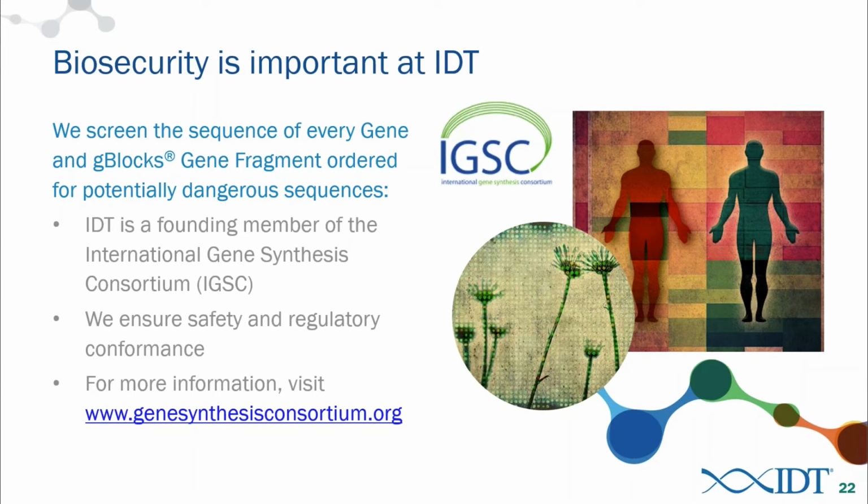So we've set up what we've called the Harmonized Screening Protocol, and this protocol is a guideline followed by almost all of the gene synthesis companies worldwide, at least the major gene synthesis companies worldwide. And it's a protocol to screen both customers and sequences to verify that these sequences are going to be used for good and that these are going to be safe sequences to manufacture. It's something that we take incredibly seriously here at IDT, and it's something that we work with our competitors on to ensure that we're doing this in a safe and responsible manner.